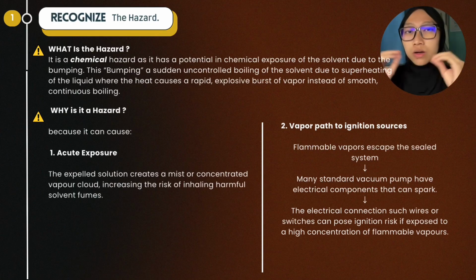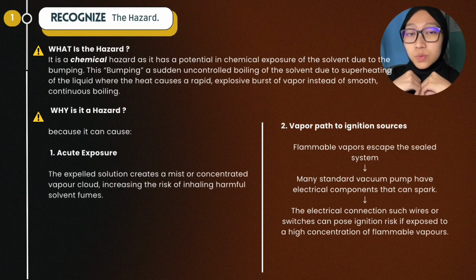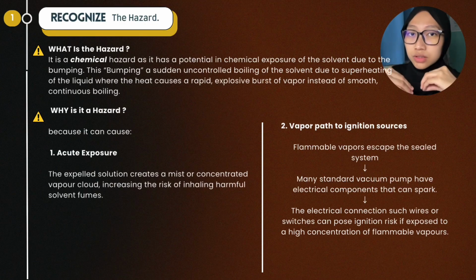Okay, so why is it a hazard? There are two main reasons. The first one is acute exposure. Why do I say this? This is because the expelled solution creates a mist or concentrated vapor cloud, which increases the risk of inhaling harmful solvent into our lungs.